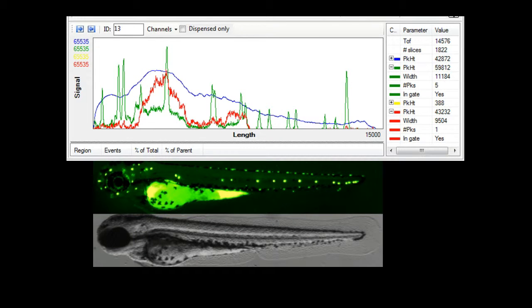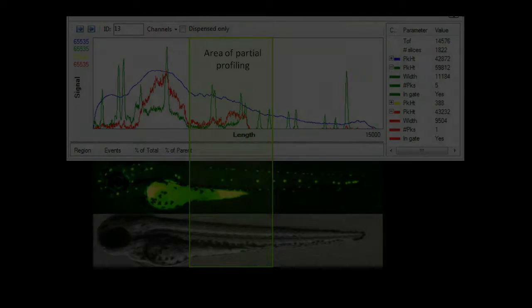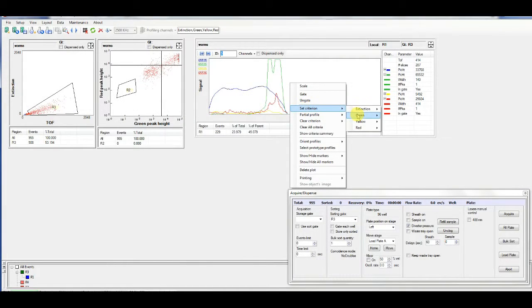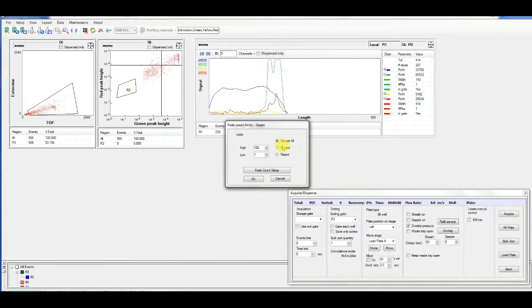Activation of partial profiling applies the profiling analysis tools to a subsection of the object. Partial profiling can be configured to analyze features exclusive to the object's head, tail, middle, or end regions. And of course, any or all of profiling criteria can be used as sort criteria.